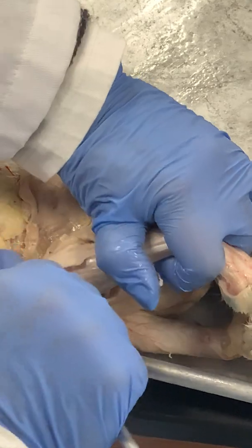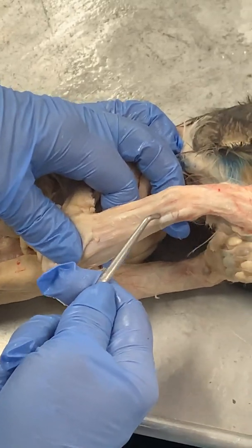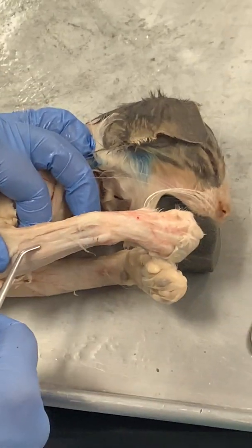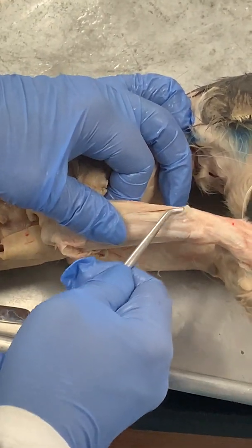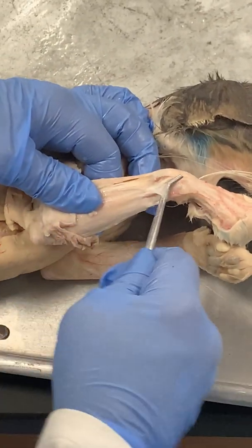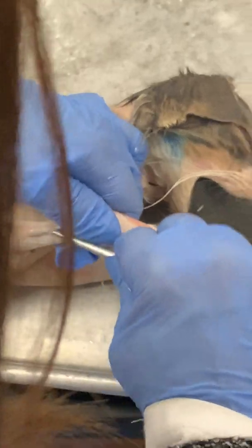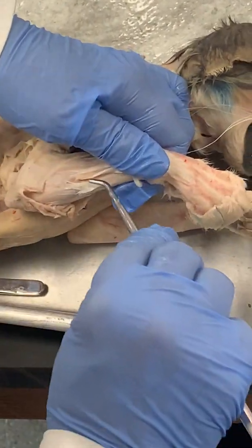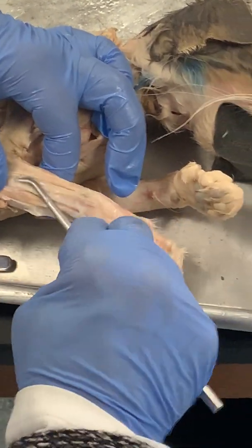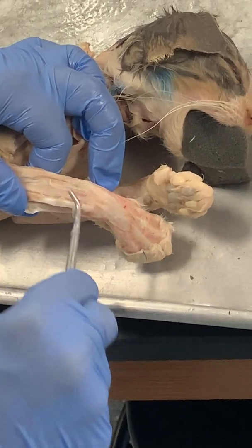Really tough skin — yeah, preservative. Look at those nice tendons though. So on the extensor side you should see four big tendons. The tendons kind of look like cords — yep, they are cords.